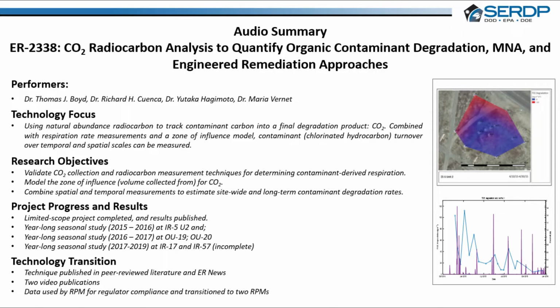CO2 is quite easily captured using sodium hydroxide traps, which can be deployed within a groundwater sampling well headspace. Collected over time, CO2 can be quantified to obtain a respiration rate. It can also be analyzed for radiocarbon using accelerator mass spectrometry, AMS.